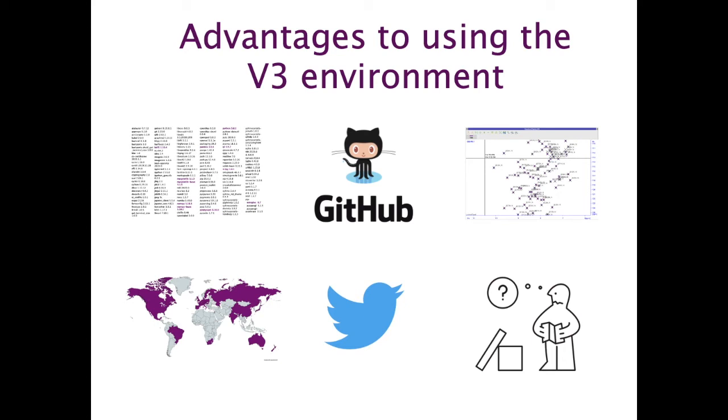So we hope you will see this as an offer to developers to be able to concentrate on the new and exciting stuff and not have to bother reinventing the wheel on the old boring things, and an offer to the NMR community to enable scientists to concentrate on the science and not have to faff around with their computers all the time. Now, this is all very well as we look to the future and people developing new things.